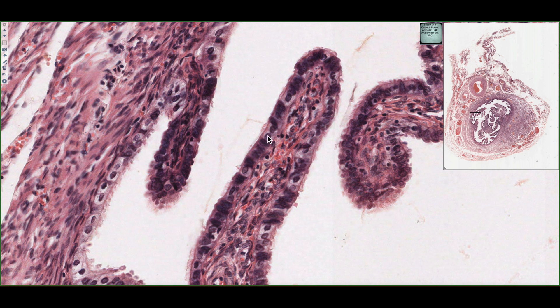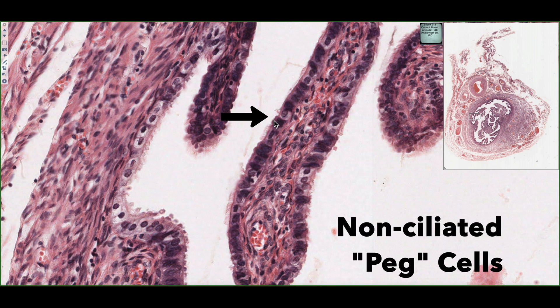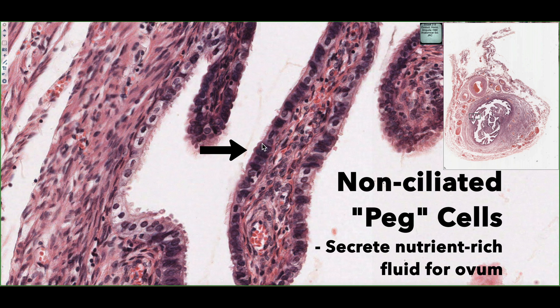Among these ciliated cells, we see cells that are more basophilic and more bulbous in shape as they project a little further into the lumen. These are known as non-ciliated cells because they lack cilia on the apical surface, but they're also known as peg cells. They're named because they look like they've been hammered into the mucosal lining — somewhat like the appearance of a golf tee. They secrete a nutrient fluid that helps support the ova during its travels toward the uterus.